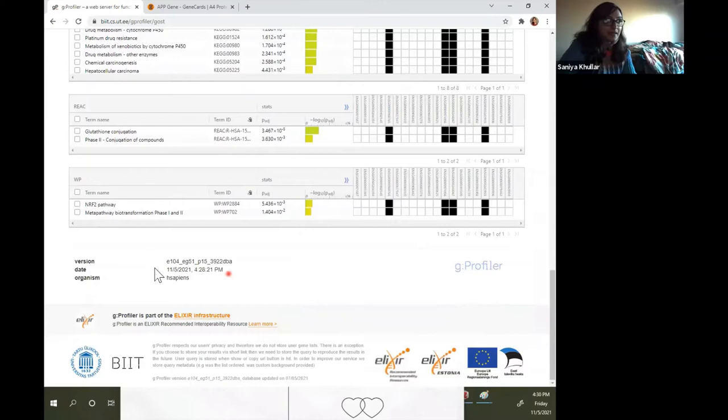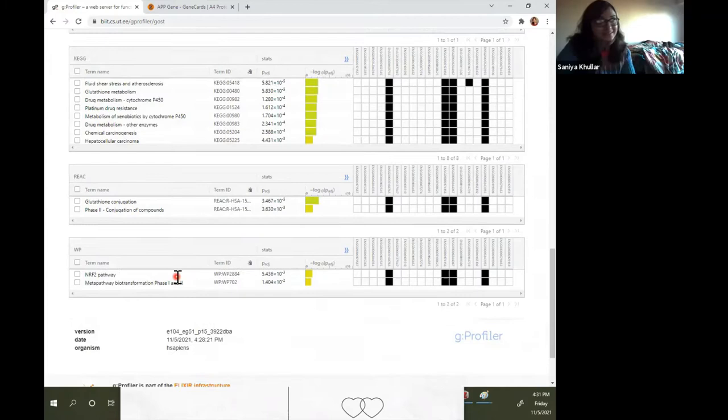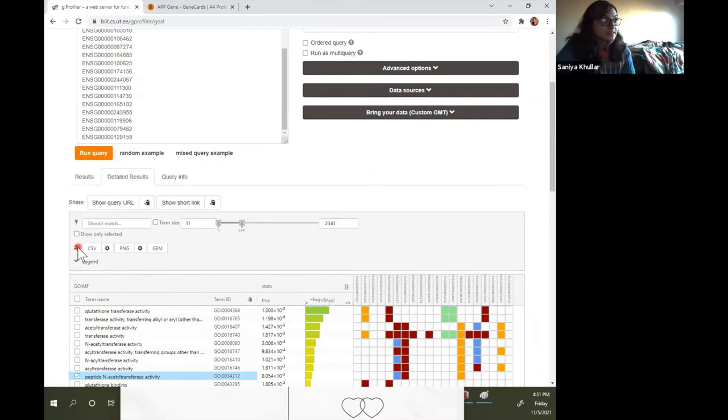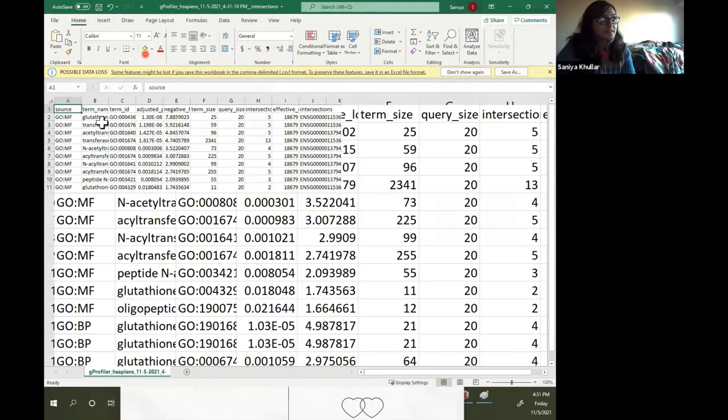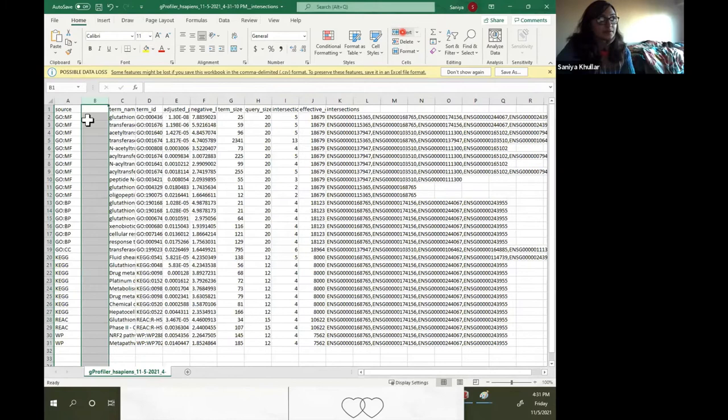When we ran this it was for Homo sapiens — human beings. You can also download the results here to a CSV. When you download them, you'll see it has a source column. This is gene ontology molecular function.